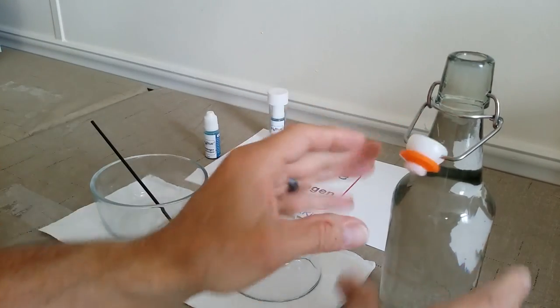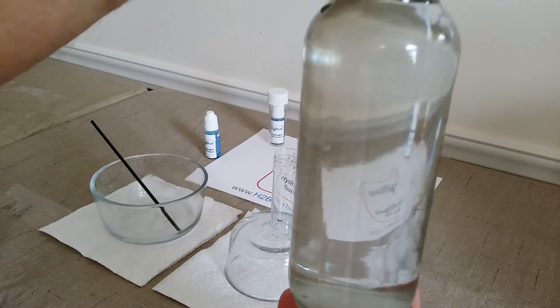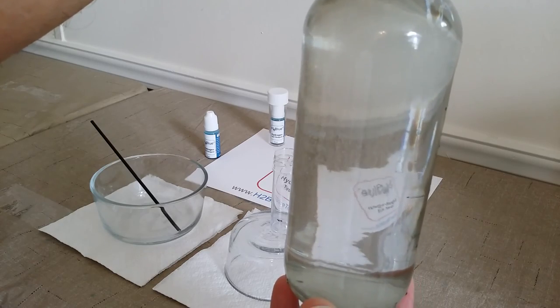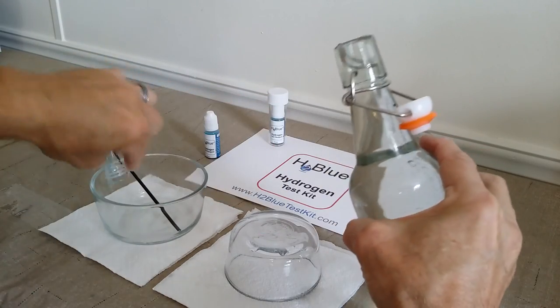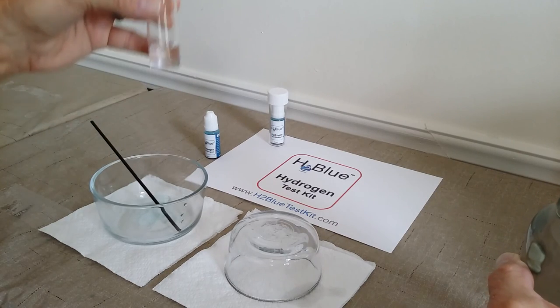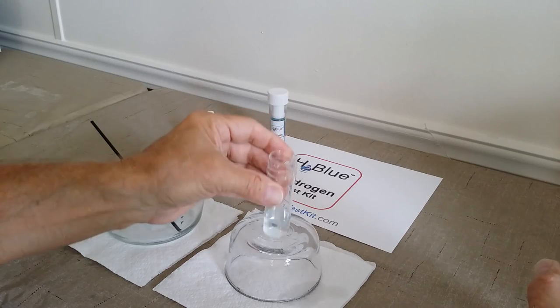You've heard the pop there. If you look closely at the bottle, once you release the pressure, you'll see the hydrogen gas is starting to effervesce just like a champagne bottle. So we want to move rapidly here. I'll pour 6 milliliters in, and I want to get it as close as possible. That's got the meniscus right where I want it.